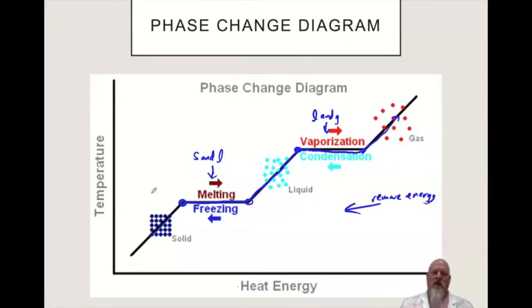Okay, so we're going to use the freezing point this one, to determine the freezing point of paradichlorobenzene. All right, we're going to take liquid paradichlorobenzene and put it in a cool water bath and watch the temperature, and then we're going to graph the temperatures and figure out where the freezing point is, because it's going to level off for a little bit.